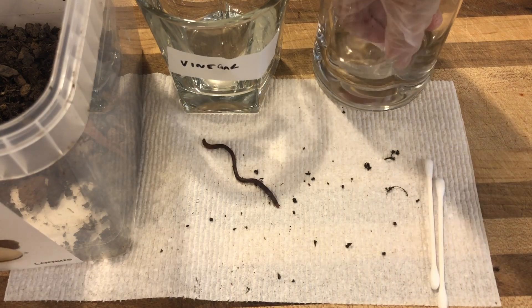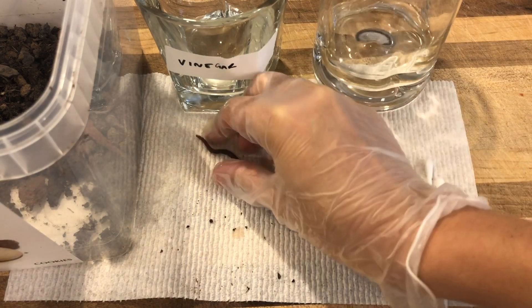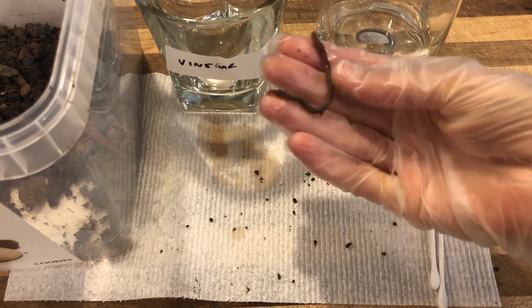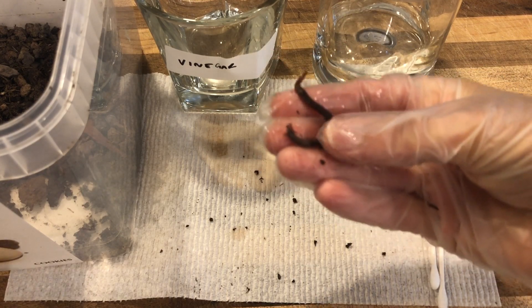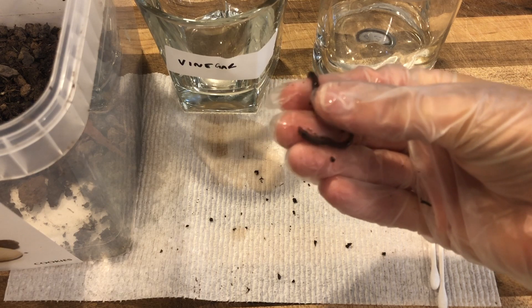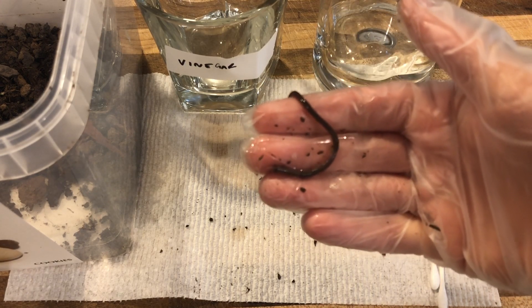Now for the fun part. Take some water and hold your worm in between a moistened thumb and forefinger. Does it have any change in behavior this way? Describe any movements it's making.